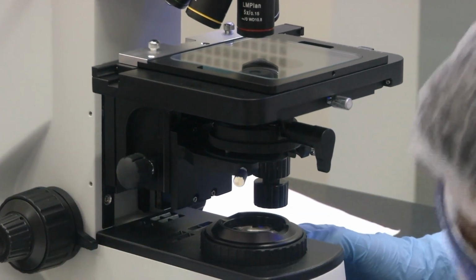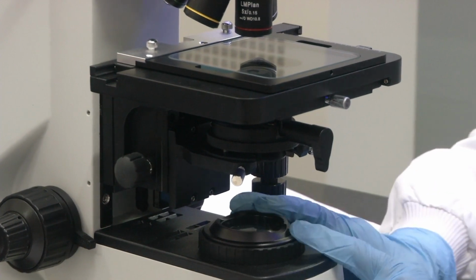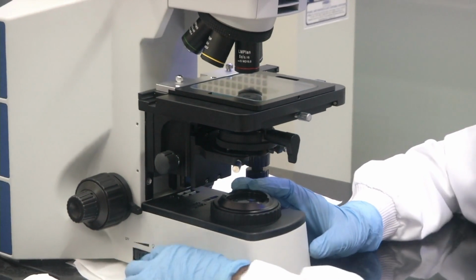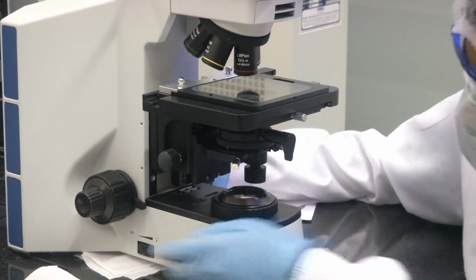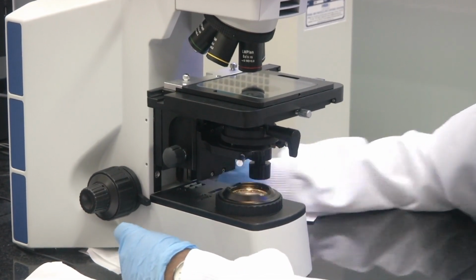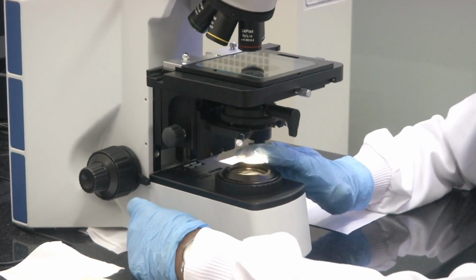Now let me get into the basic knobs first. As I showed you before, this is the bottom light source. Here you see a switch. This is for switching on the bottom light source. So let me switch it on. It is just a rotation. I rotate it, and the light source comes into picture. I think you can see the light. See, my hands are glowing. Let me switch it off now.